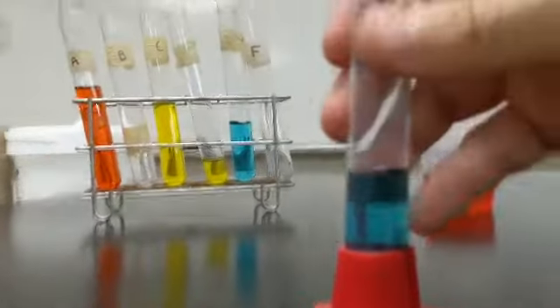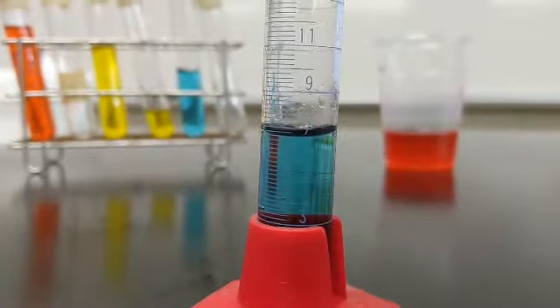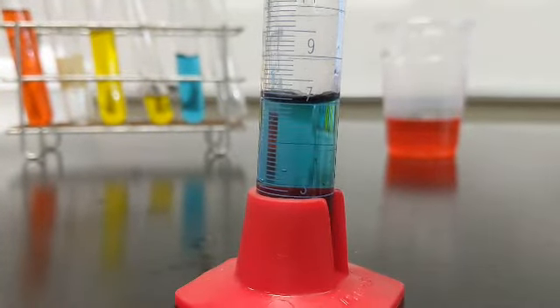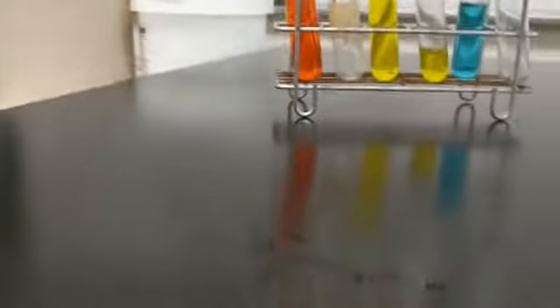Okay, good, there we go. I'm going to call that close enough to 7. See that? You can see a little bit better now. That's actually perfectly 7. So we're going to pour that into test tube D.